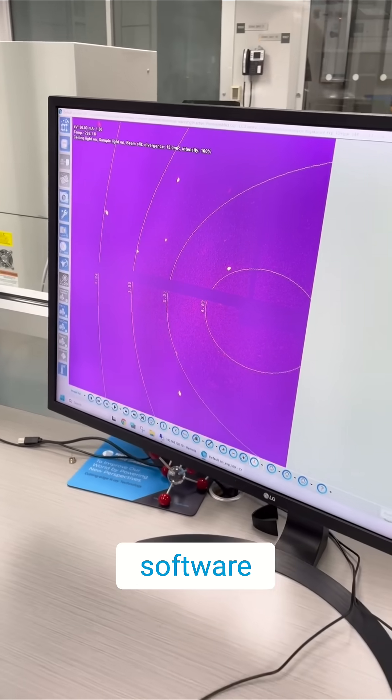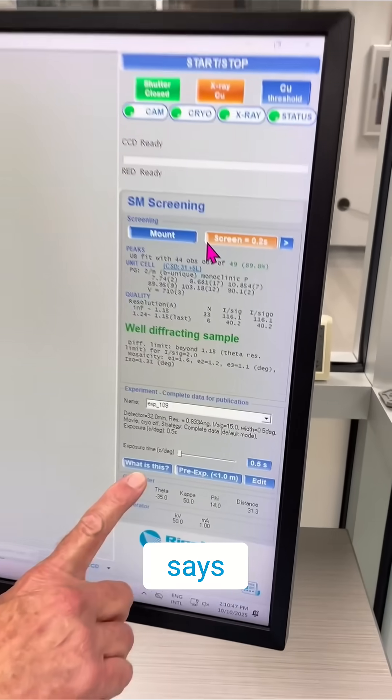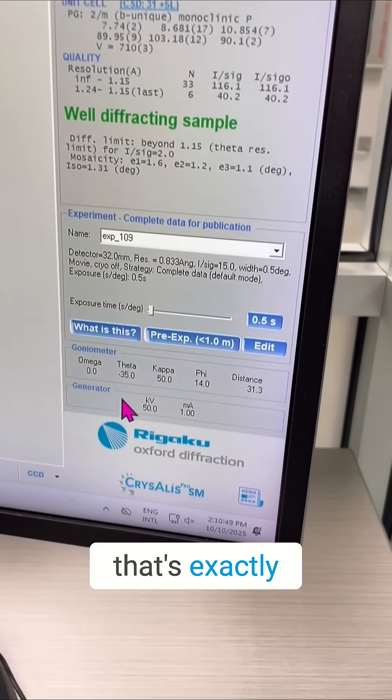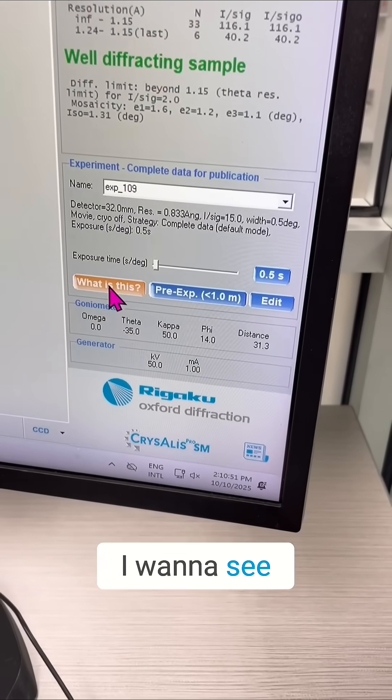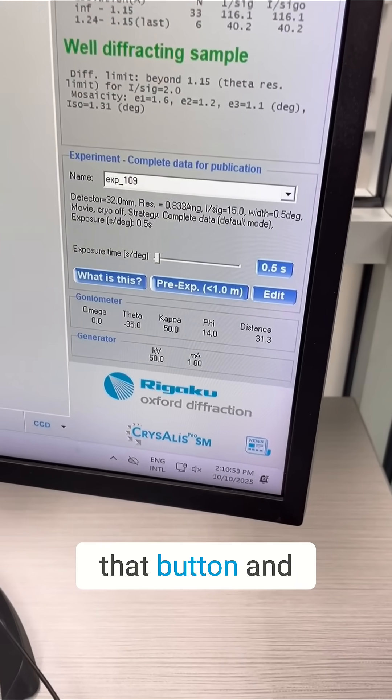So over on the software, I don't know if you can see this, right here there's a button that says 'what is this?' Well, that's exactly what I want to do. I want to know what is this. So I'm going to hit that button and tell it to start.